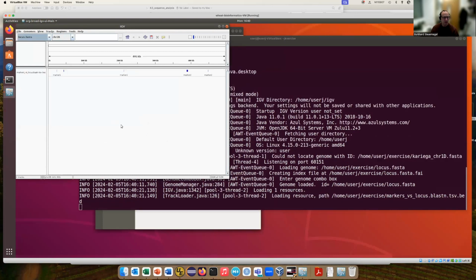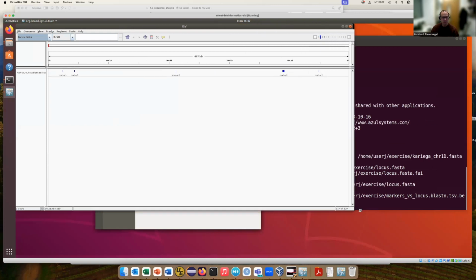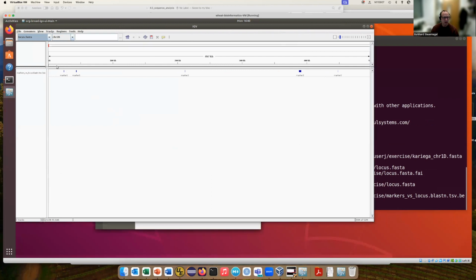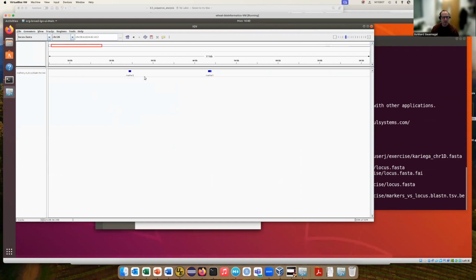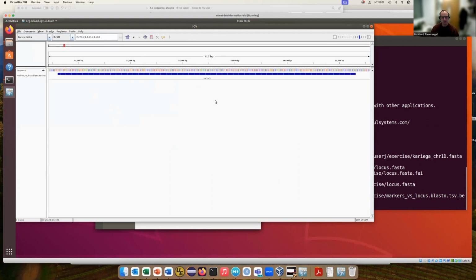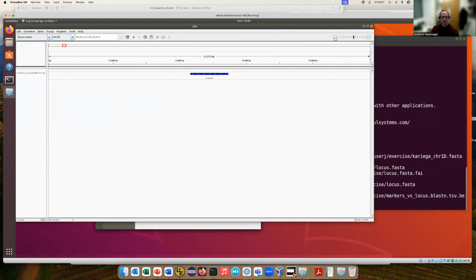And you can see we have several hits here, which is slightly annoying, but of course, we will have the best hits. So this hit has a length of 830 bases. What is the other one? This looks a bit shorter. What is that? Yeah, this is just 600 bases.